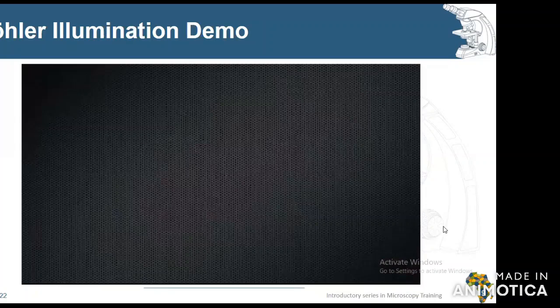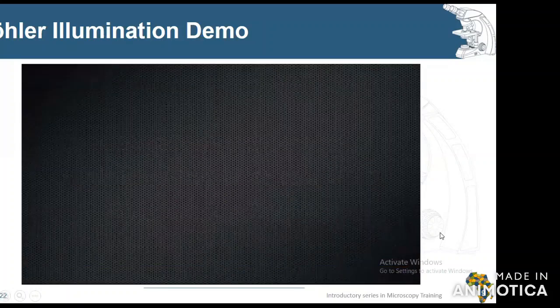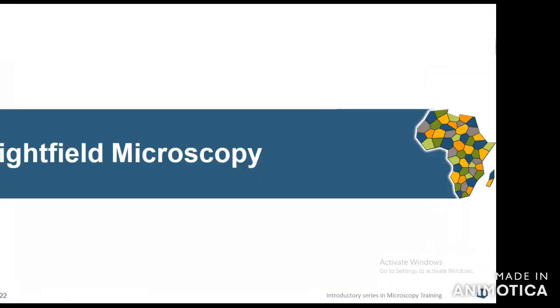So I still want to recommend that these are something we can also help ourselves with, even on YouTube. We can also watch it on YouTube to have a better understanding of what the Köhler illumination procedure is all about. Like I said, it is always very essential that we do it in order for us to have a better contrast and a better imaging any moment or any time that we want to do photomicrography.